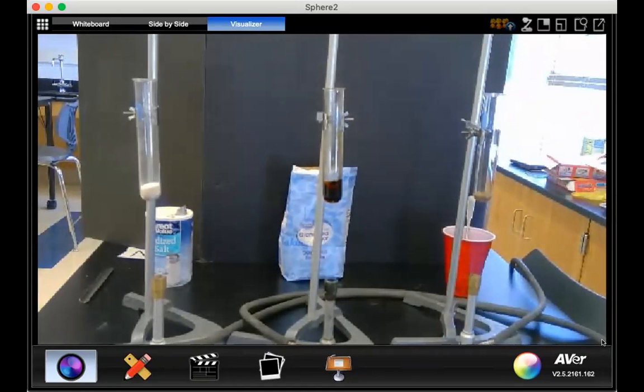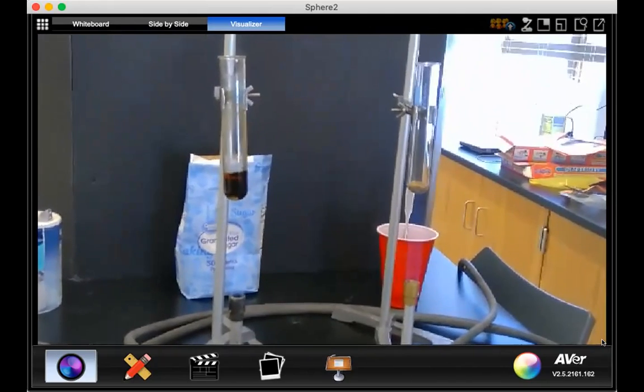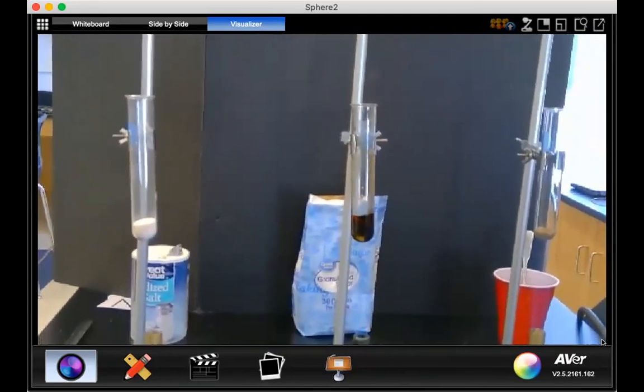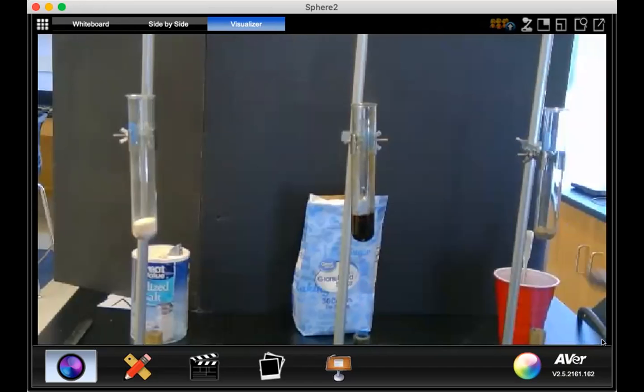So we've been going for a couple minutes now, so you can record your observations. Once again, if we look, we don't have much of anything occurring in the salt test tube. In the lead test tube, we can try to zoom in a little bit more maybe. Might see a little bit, some of it melting at the bottom there. The sugar, of course, is where the most of the action is happening. As we get ready for minute number 3, burn a few more of those fumes off.